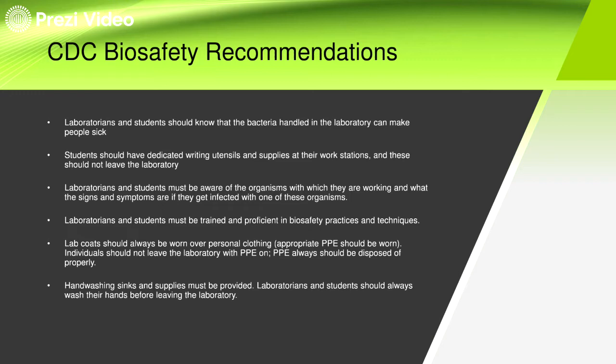Okay? So, laboratorians and students must be aware of the organism in which they are working and what the signs and symptoms are if they get infected with one of the organisms. Definitely, you should know the possible signs and symptoms. This will be your way to know if you are infected or not.